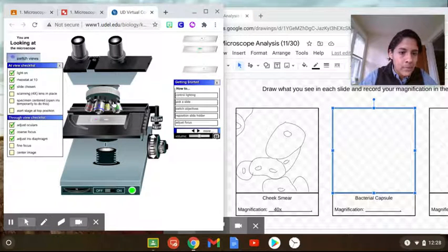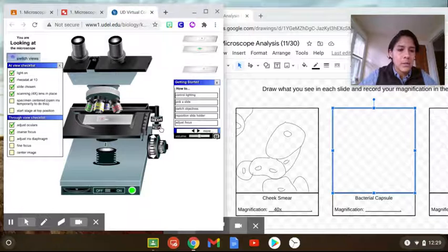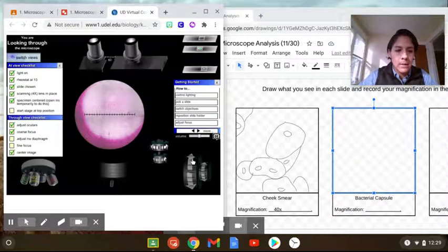I'm just going to get the slide. I just have to move it so that it's in position, and then I'll show it to you. I would also recommend pausing this video so you can take a look. All right, so there's my sample.